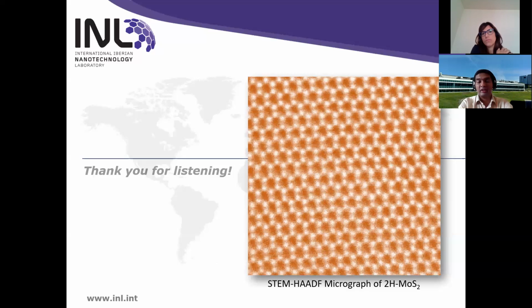So I'm a little doubtful. If we are able to freeze the protein structure, using some epoxies or other things, and then cure it, so the position of the atoms or rather molecules remains there, then probably we may be able to look at it, but directly the dual beam cannot be used.